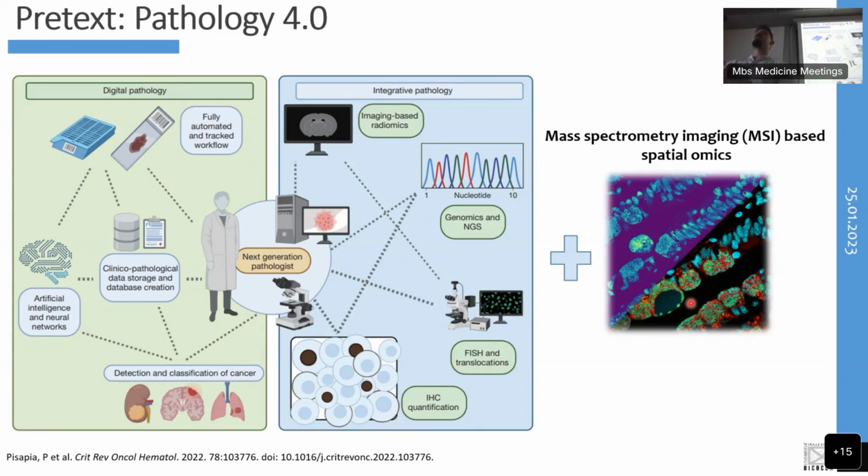I did a little bit of reflection myself and thought, okay, why in the last 5-6 years or so has mass spectrometry imaging started to be associated with this field of molecular pathology? Because in all honesty, 10 years ago, there was a lot of hype with this technology, and you would see it applied in a variety of different disease contexts. And then there was a lull, a certain stalling of progression of this technology. This is because there were a number of obstacles that needed to be overcome in order to render it more appropriate for application in pathology.